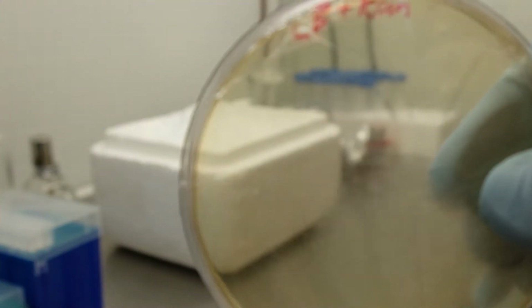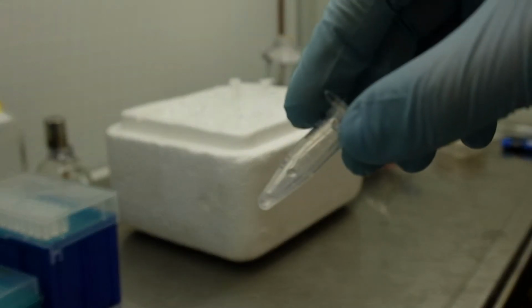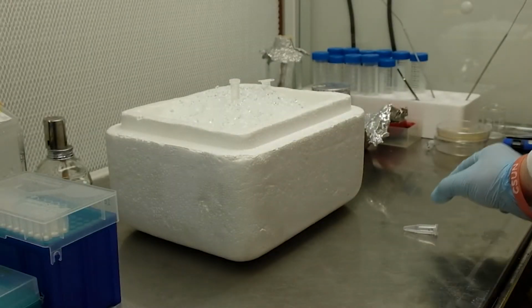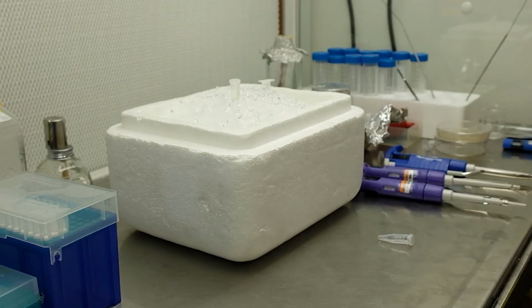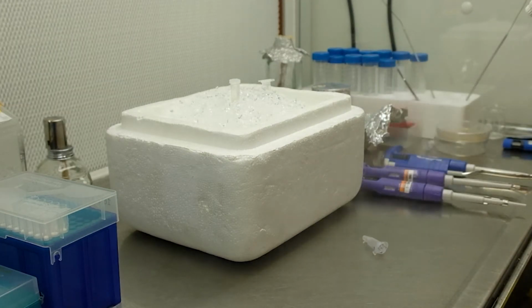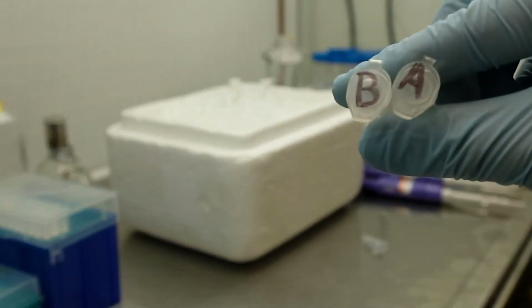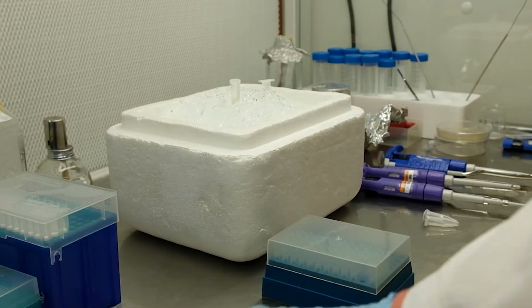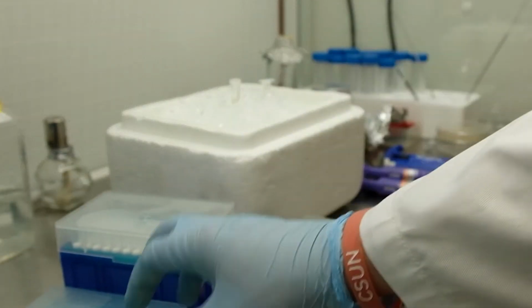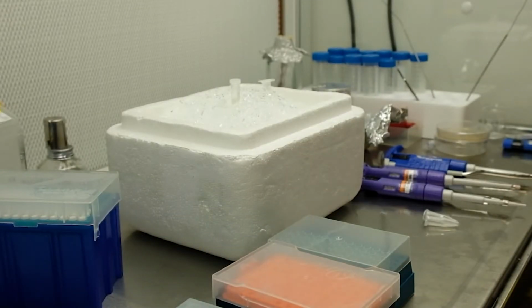Prepare your solid media with the right antibiotic and set it aside for now. Get your plasmid DNA. It must be pure and concentrated. Have all your necessary tools handy and sterile, and you will need a fresh microfuge tube for each one of your cultures. Pipette tube boxes should be conveniently arranged and, you guessed it, sterile.